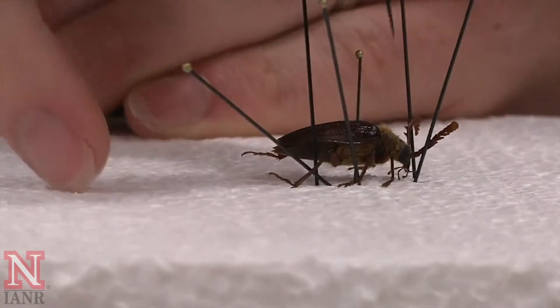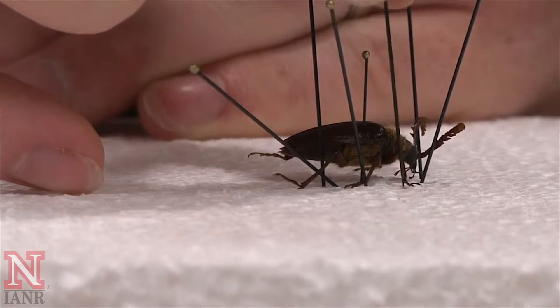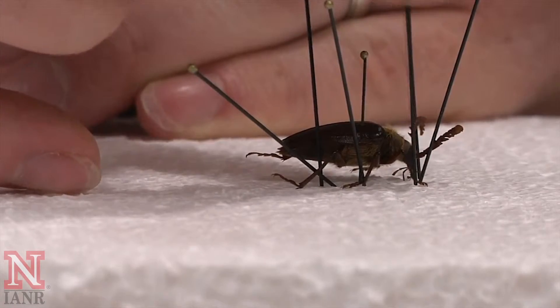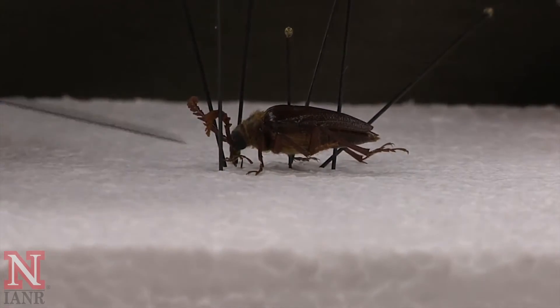The legs and the tarsi of beetles are particularly important for identification purposes, so it is important that you need to be able to see all the characteristics that may be on those legs.